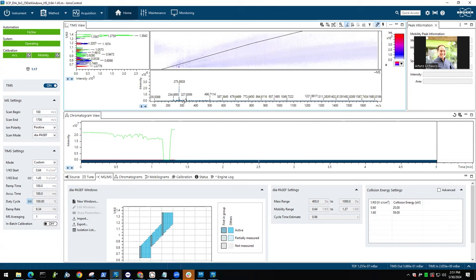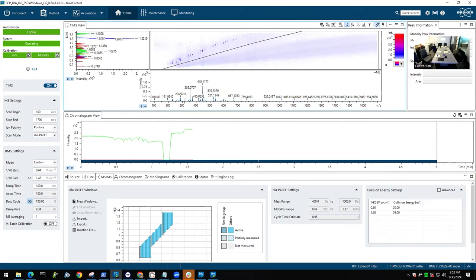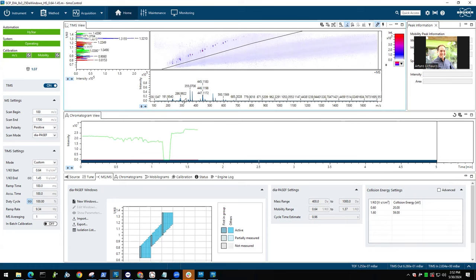Right now the air that we are drawing in is fairly clean because it goes through an activated carbon filter. When I take this off, the room air gets in, and you see all the contaminants we have in the air. There's a lot of them. There are polysiloxanes in the air coming from the paint, from the floor, from deodorants, whatever. Other contaminants might fly in, and we actually make use of these contaminants and calibrate our system with them. So we don't have to infuse any tune mix or something.